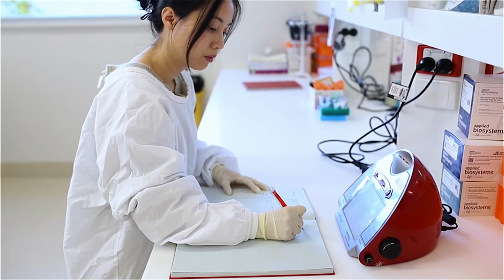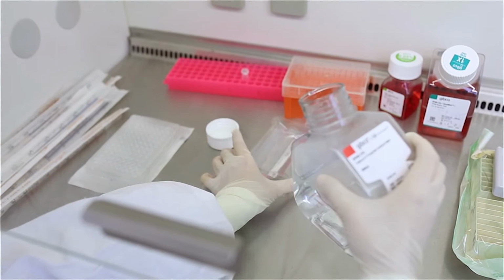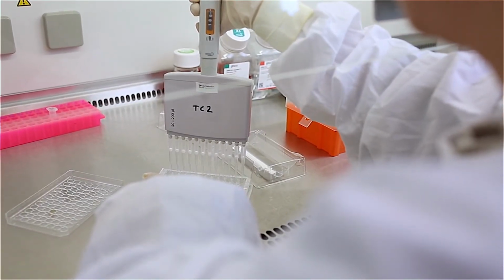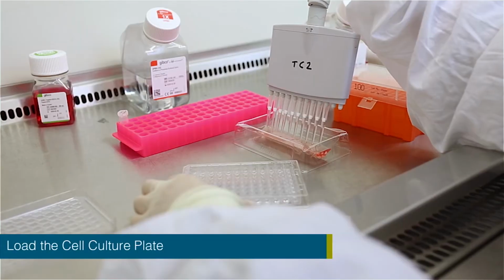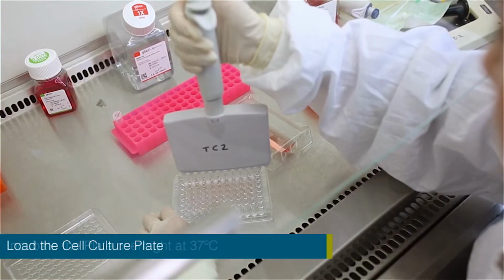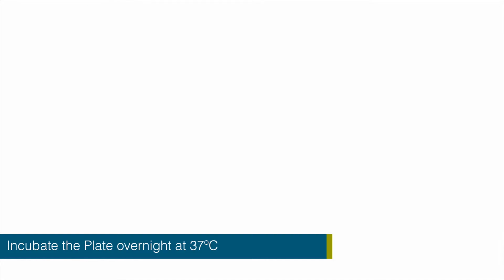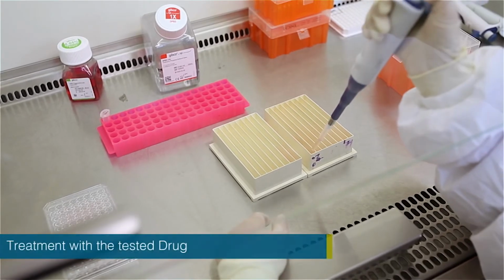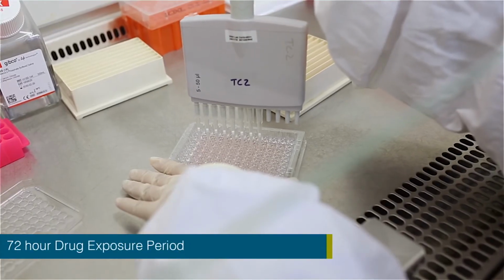Taking into account the known concentration of cells in the cell suspension, the cells can be diluted further with growth media to obtain a desired concentration. Equal volumes of the diluted cell suspension are then seeded within each well of the cell culture plate. The cell culture plate is then placed into the cell incubator to allow the cells to adhere and grow. The next day, the cells are treated with the drug of interest at varying doses, and the cells are then placed back into the cell incubator.